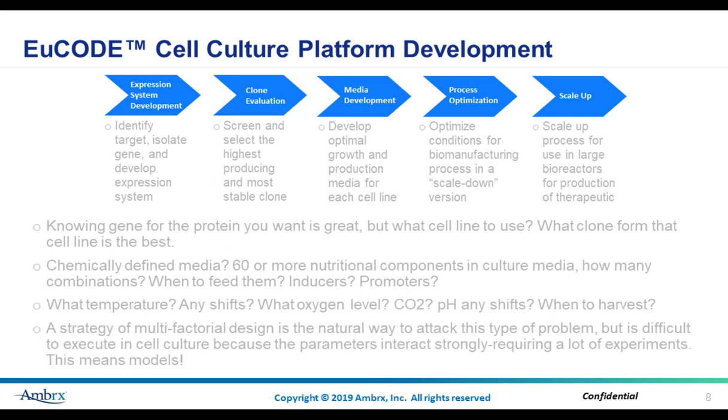Cell culture process development starts with cell line generation and selection, followed by media and process development and optimization in small-scale systems, including 96-well plates, shake flasks, and bench-scale bioreactors for high-throughput screening purposes. Once conditions are defined, the process is often transferred to pilot scale to test scalability and produce materials for preclinical tox studies, and then large-scale manufacturing for production of clinical material under cGMP regulations.